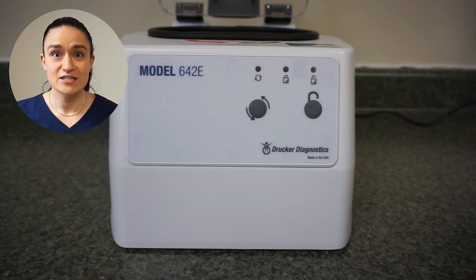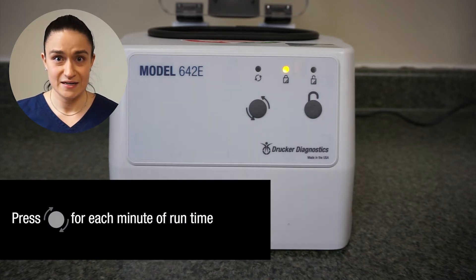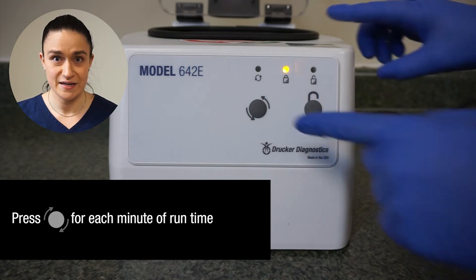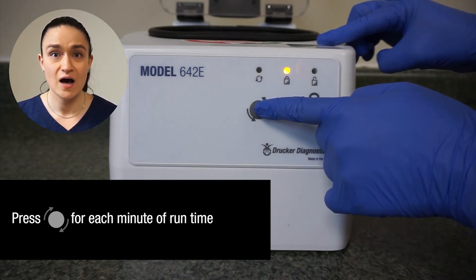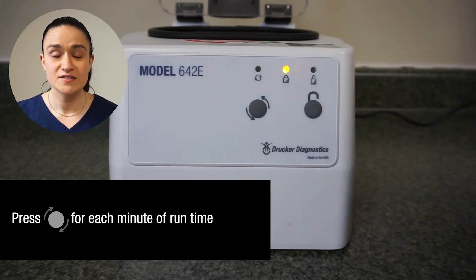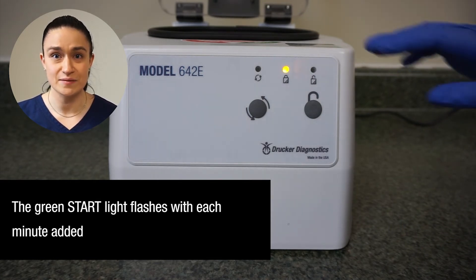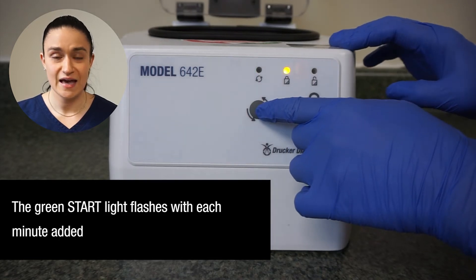Now we're ready to change our spin time. The start button will control the spin time — every press of that button adds one minute onto the spin. We're going to be changing our spin time to two minutes, so we're going to press that start button once and twice.